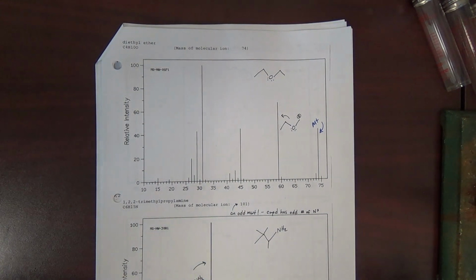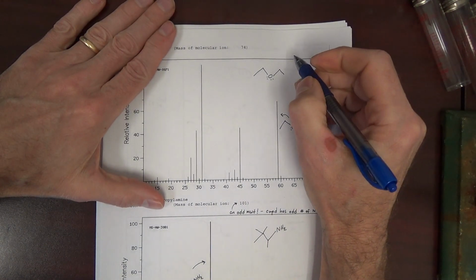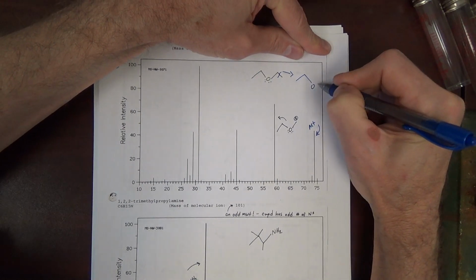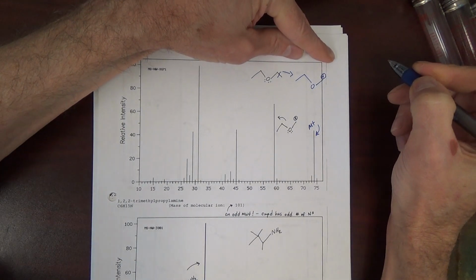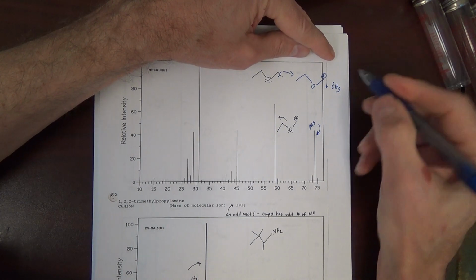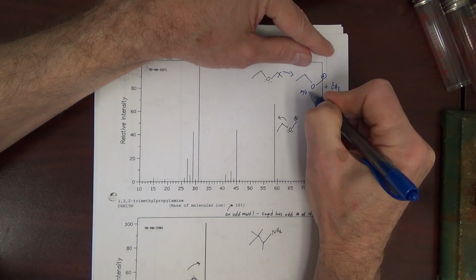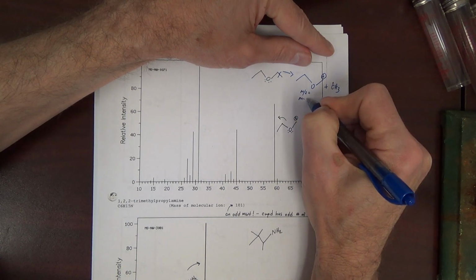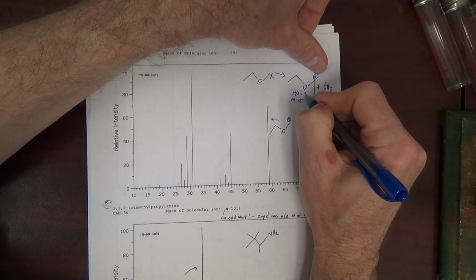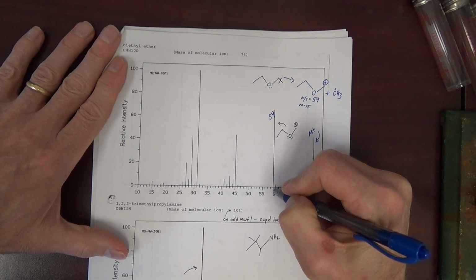At this point, we're going to start cleaving in a very predictable place, and we're going to call it alpha cleavage. This molecular ion, or radical cation, is going to cleave here to give, boom, boom, oxygen cation here, plus a CH3 radical. Could have just drawn that here. This and this is the same thing. This is going to have a mass to charge ratio, well, it's M minus 15, because that's 15. 74 minus 15 would be 59. Do we have a peak at 59? Yes, right here's our peak. That's 59.